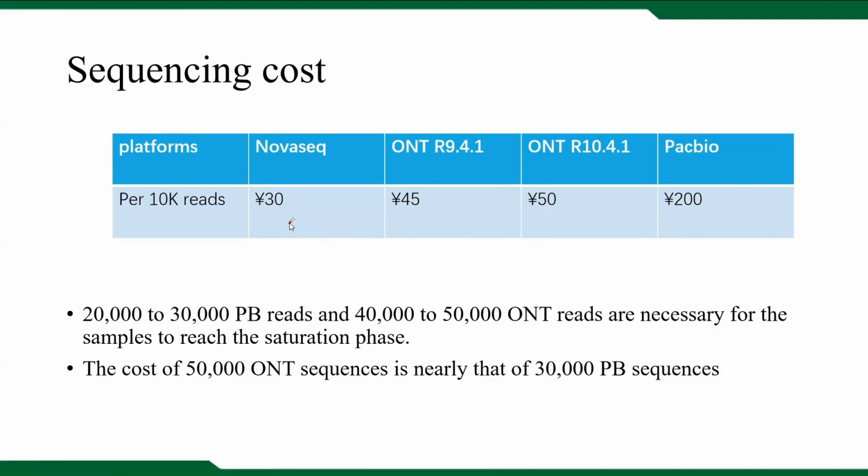Considering the advantages of high throughput and the portability of nanopore sequencing, we believe that more researchers will employ nanopore sequencing to explore environmental microbes.